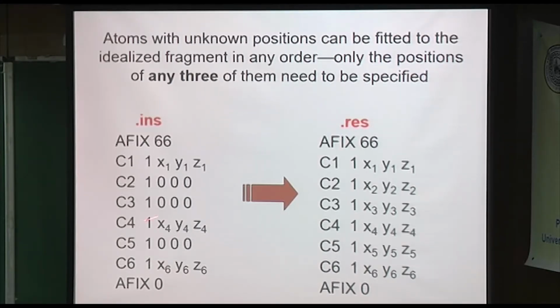They could be either bonded to one another or they could be spaced, but you're pretty sure it's a benzene, and you have 3 atoms you're pretty sure about. So let's say you've numbered your benzene ring 1, 2, 3, 4, 5, 6, and atom 1 you have positions for, atom 4 you have positions for, and atom 6, at least approximate positions. Then these, 2, 3, and 5, you're not so sure about. So you don't need them. You only need 3.